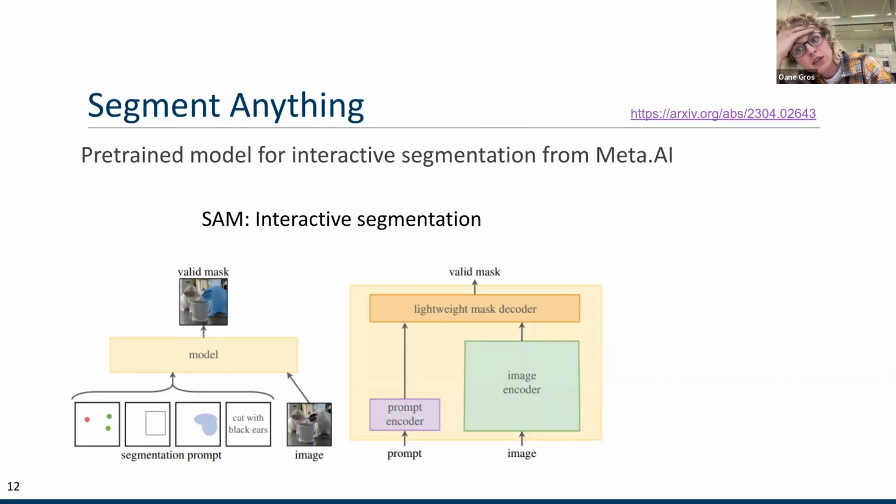Yeah, so you have these two encoders, one of which is really hard to retrain. How fast, as a user, do you know that the issue is actually in the image encoding and that you will not be able to get a good enough result just by extra training of the prompt? How fast is the prompt encoding trainable? Because otherwise you don't know, essentially.